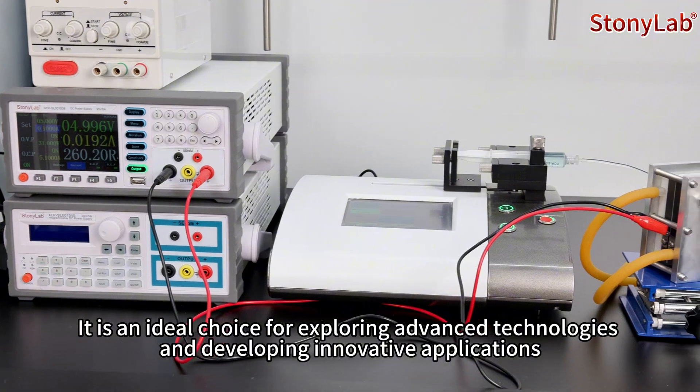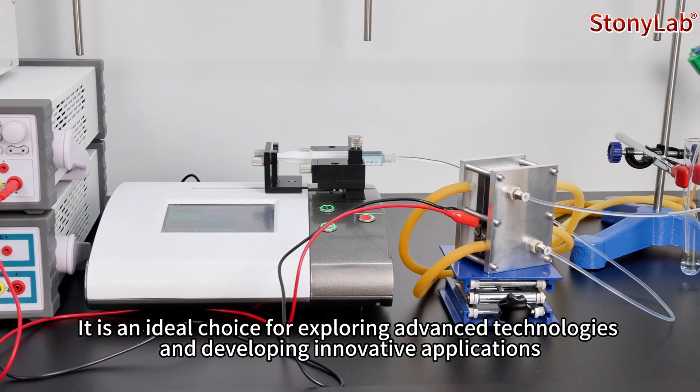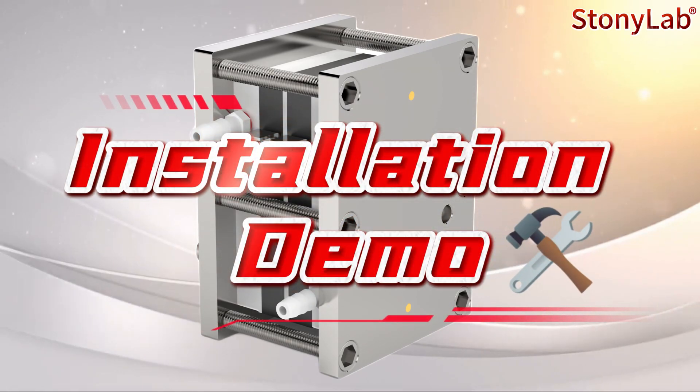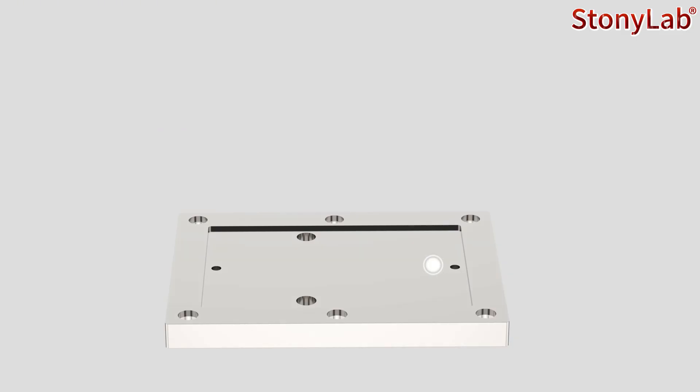It is an ideal choice for exploring advanced technologies and developing innovative applications. Next, let's take a closer look at how to install the device.